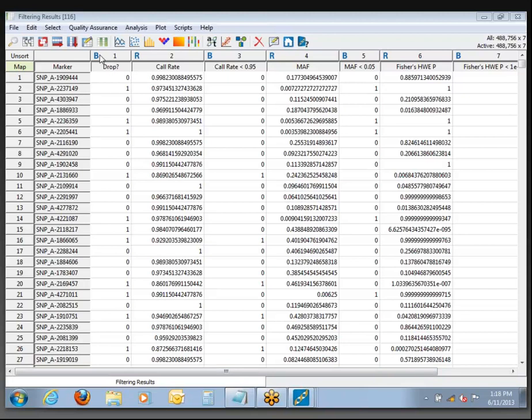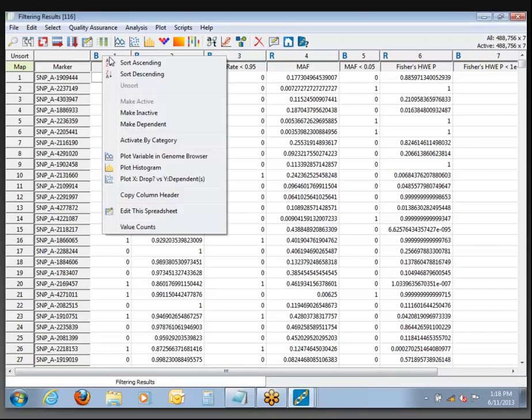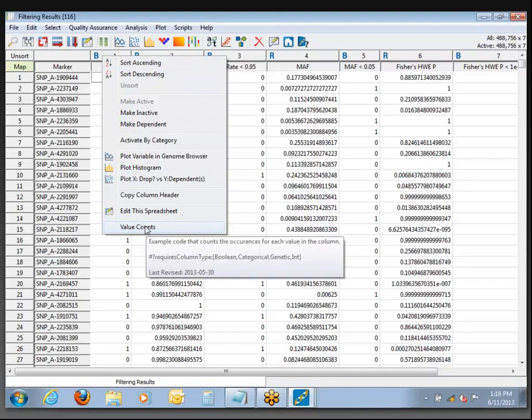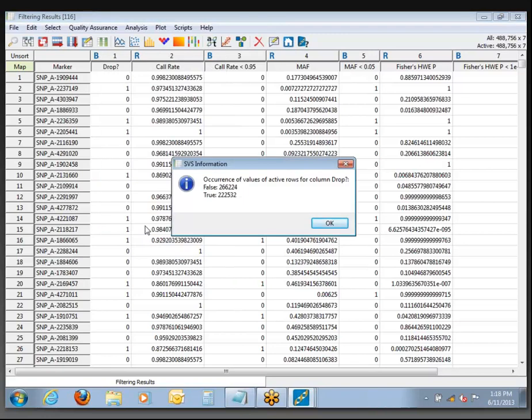Since this is a binary column, if we right-click on this one to see what our options are, one of the choices now is Value Counts, which will give us just a frequency summary. If we click that, we can see 222,000 true — meaning they were removed — and 266,000 false, meaning they remain active in the data.